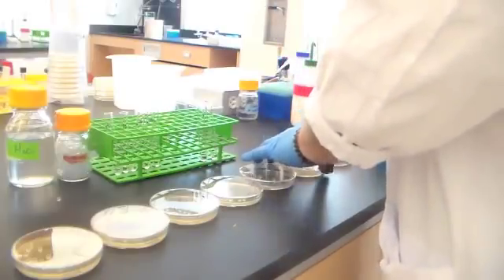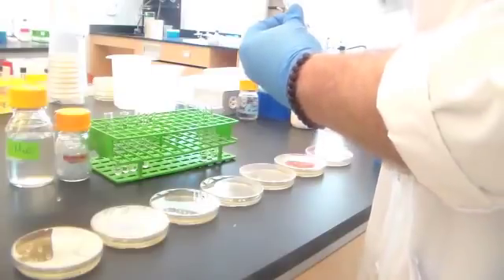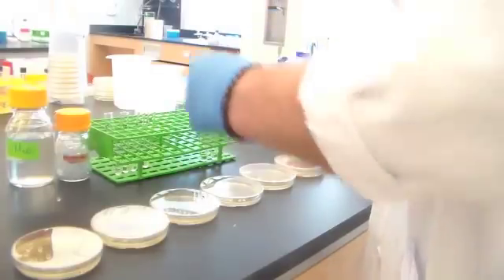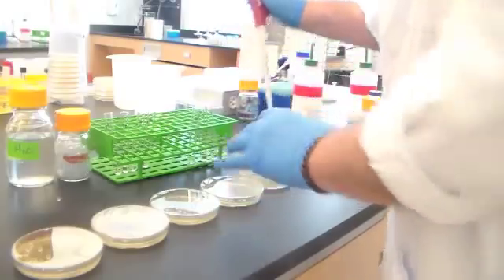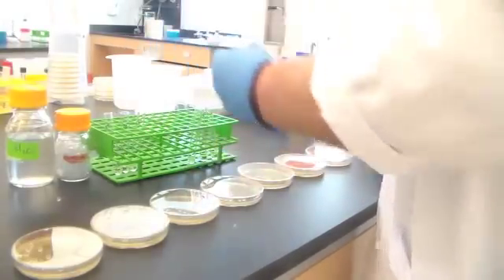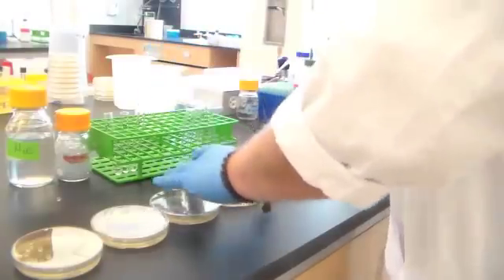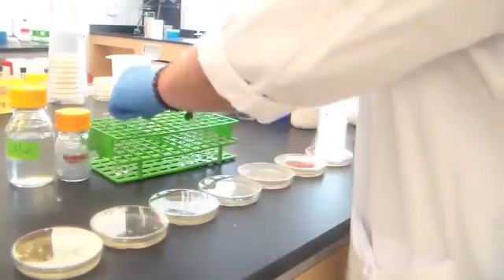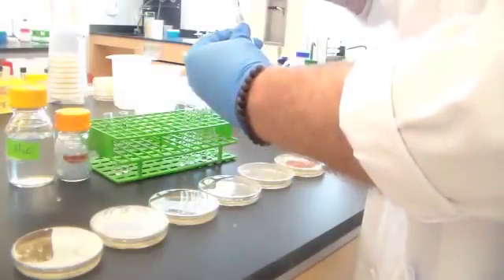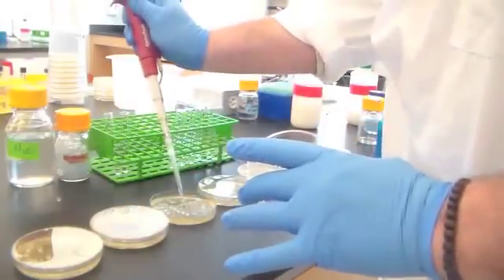Put that on. We go to 10 to the minus 5. Pull out 100 microliters. Minus 4. Minus 3.